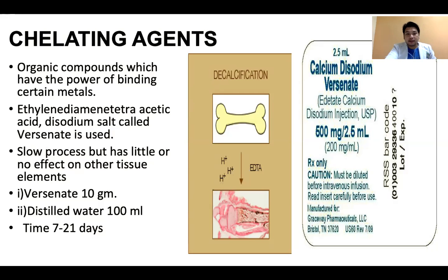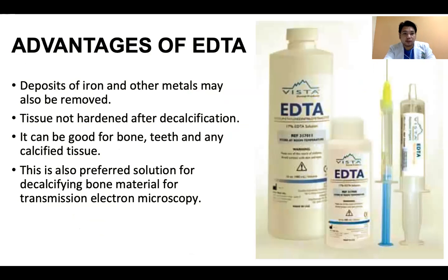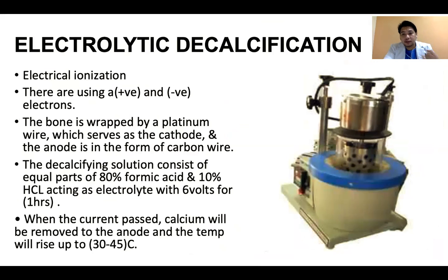So, tandaan natin, class, ha. So, ito yung ating example ng EDTA for bones and teeth for decalcification. So, first, di ba, yung ating acid. So, ni-remove nyo yung bones through dissolving calcium ions.